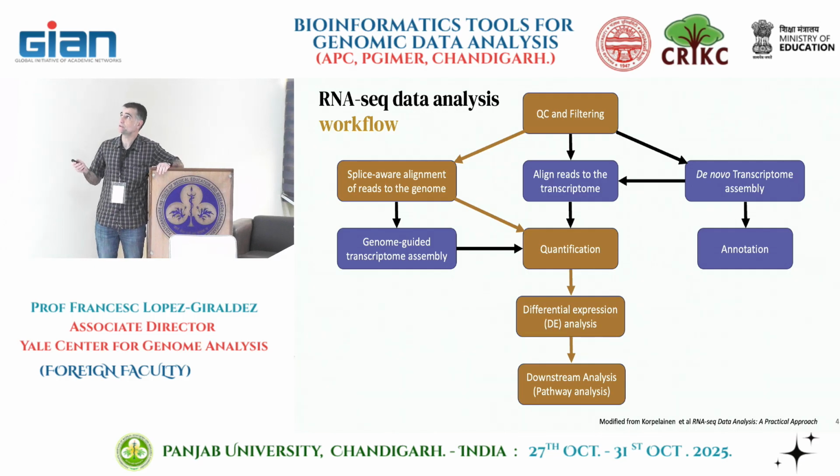We have the samples. We're going to do QC and some filtering. We're going to use a splice aligner to align our reads to the human genome. We're going to do quantification. Actually, these 3 steps, we'll do them this afternoon. And tomorrow, we'll focus on differential gene expression analysis. And depending on time, we may do some downstream analysis.